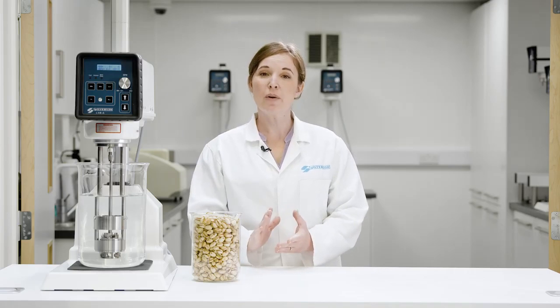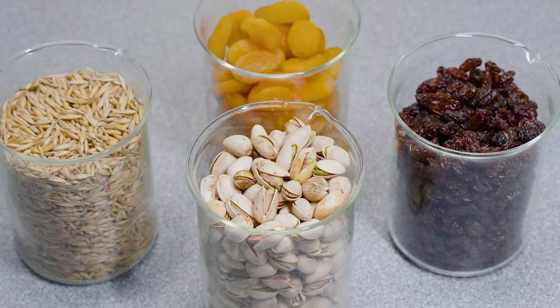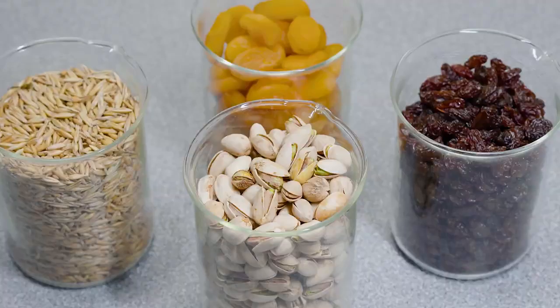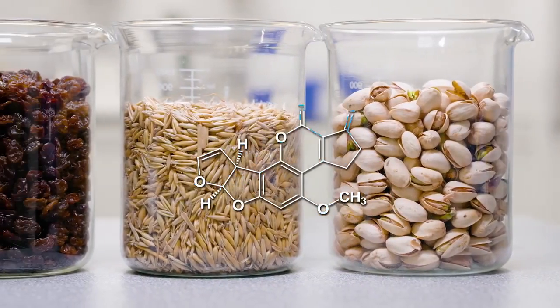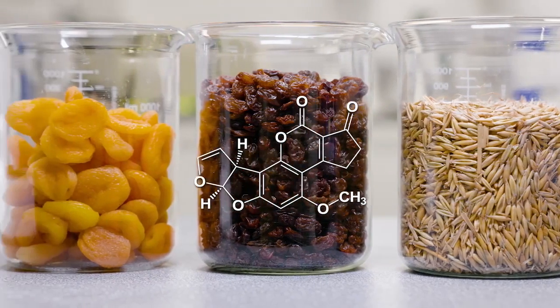In this video, we're going to demonstrate how Silverson mixers can be used in the preparation of samples for aflatoxin testing. Aflatoxins are produced by various types of molds which can grow on foods such as pistachio nuts and peanuts.